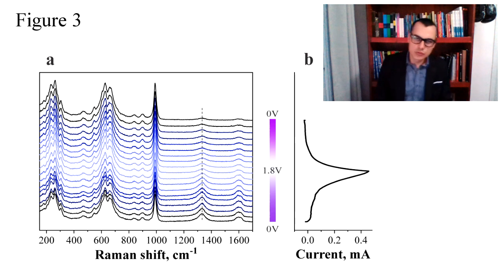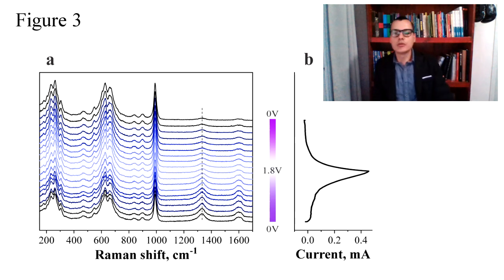Okay, let's move on to the next slide. Figure 3a shows the spectra obtained during dynamic conditions of the supercapacitor made with carbon-based material decorated with niobium. In this figure, we can see all the peaks corresponding to the niobium material decorating the electrodes, and the peaks referring to carbon. Thus, our analysis will be separated between these two regions.